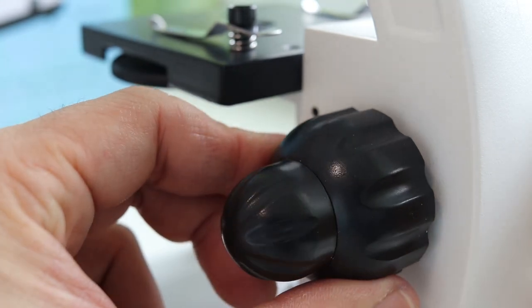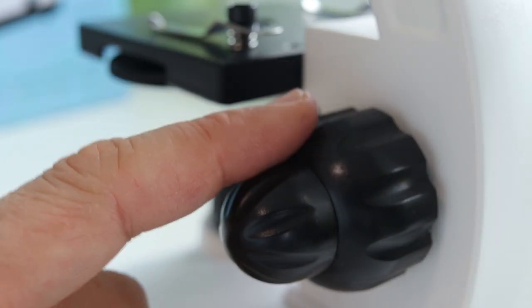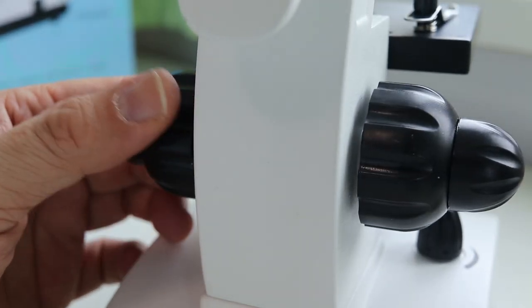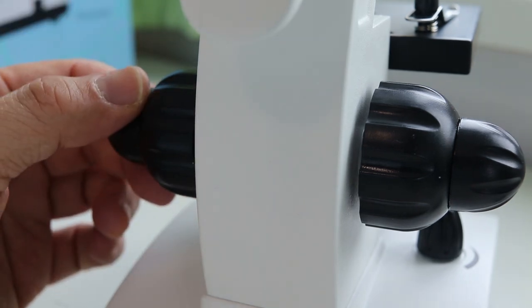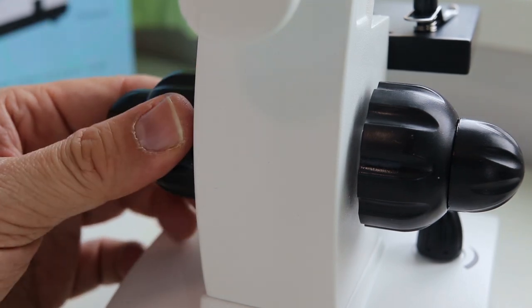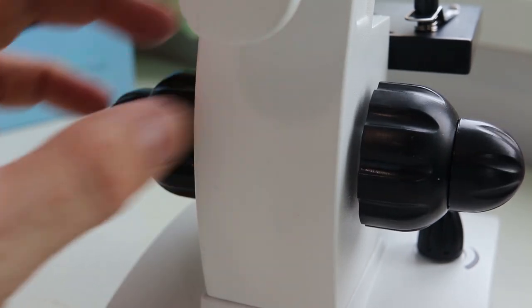This is one of the reasons why I actually chose this microscope, because it does have two focus knobs. Many other microscopes actually only have one focus knob, but I wanted to have one with two, because this is also something that you can find in more expensive microscopes. And for me, this was one of the criteria for selecting this particular microscope.